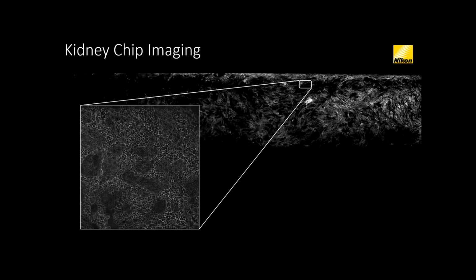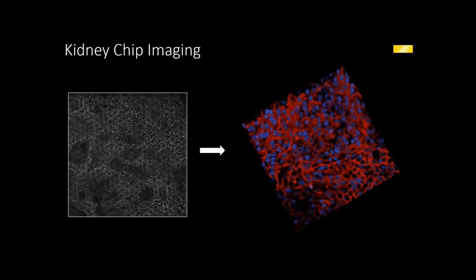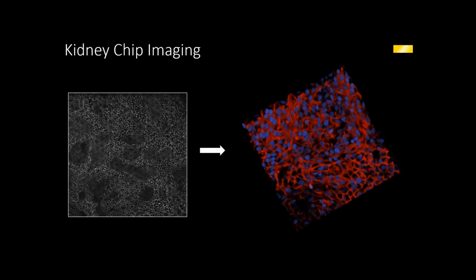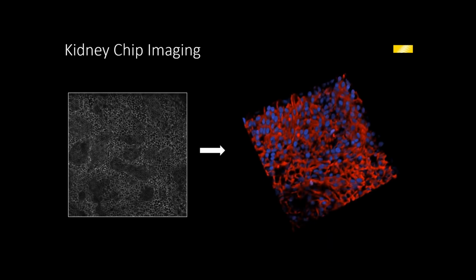So now we can combine these high-end three-dimensional human cell models with imaging to get a complete picture of what's happening in this system based on either, like we've said before, genetic differences between sample types in the cells, or by treating them with compounds. And we can get a very nice high resolution image from these that can then be used for things like 3D modeling, where we actually look at the structures of the components, for instance, the proximal tubule structures under the influence of different genetic and chemical perturbations. So again, this is all very exciting.